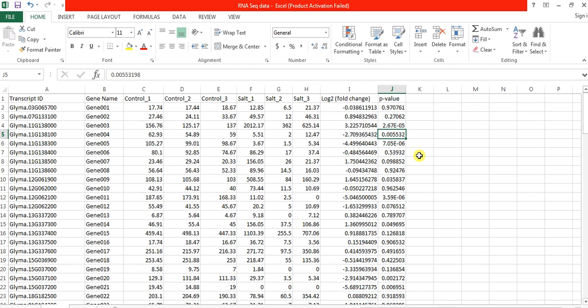But by preparing or by presenting it through Volcano plots makes it easy to choose your gene in a single view, to see which gene has the up-regulation and significant up-regulation, while which gene has significant down-regulation.